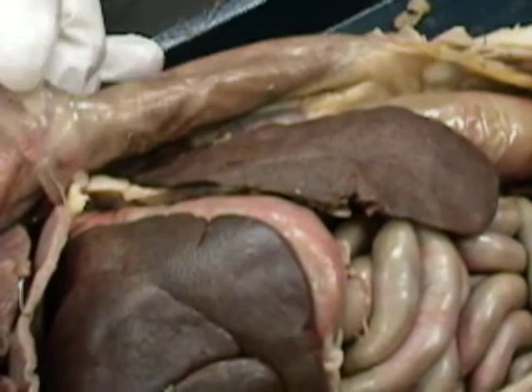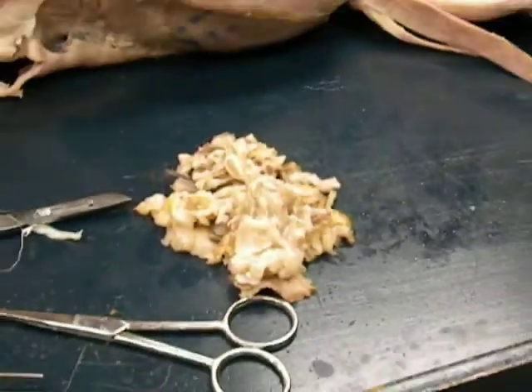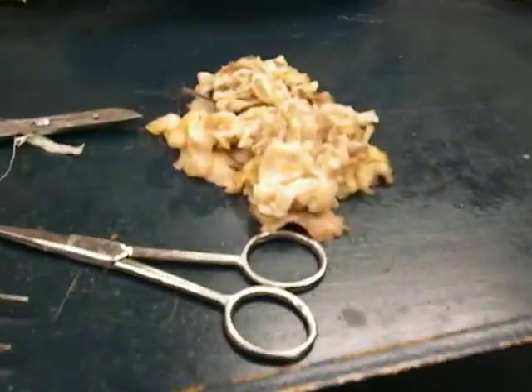Okay, so then we had the greater omentum, which you took out. Is it one piece still, or is it a bunch of little pieces? We can kind of piecemeal it back together, because it may dry out a little quicker if you don't have it there, but that's good.